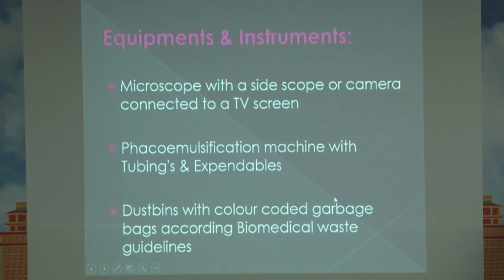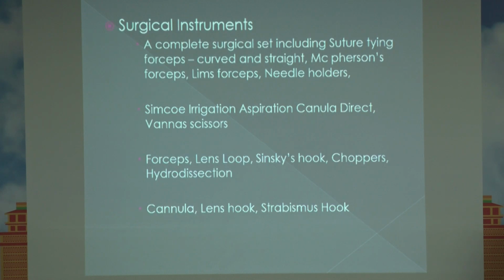Equipment: at least, I suggest one microscope, either new or old or any one, table mounted or not table mounted. Nowadays many Ambala-made companies are also giving table-mounted microscopes at very low cost, and that can be used for training in each and every institution.